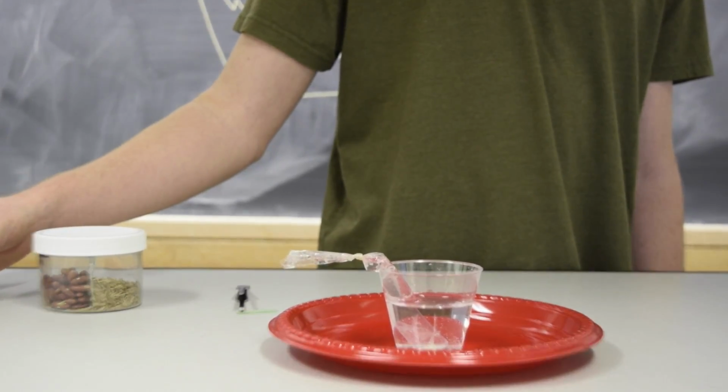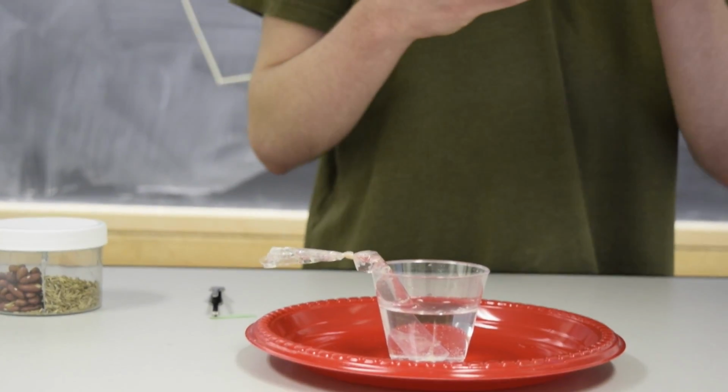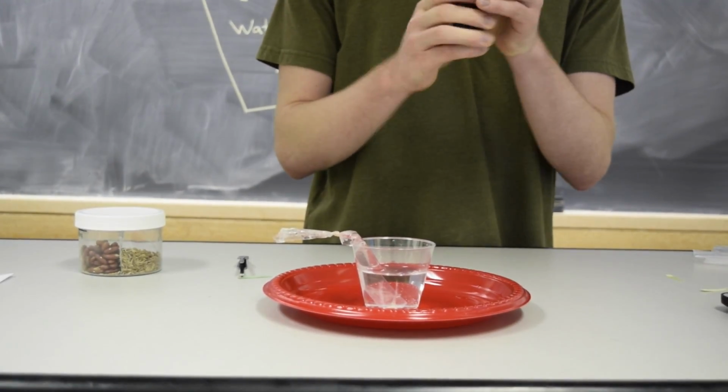Next, we will test for starch. Have students pour the rest of their iodine into the cup.